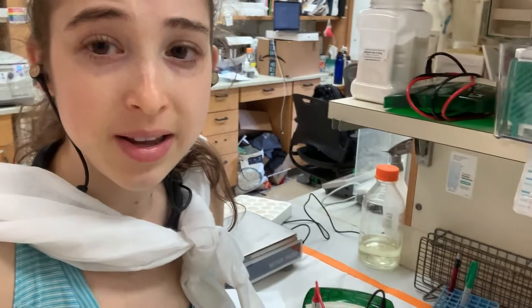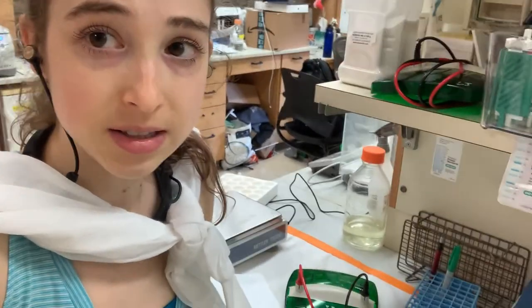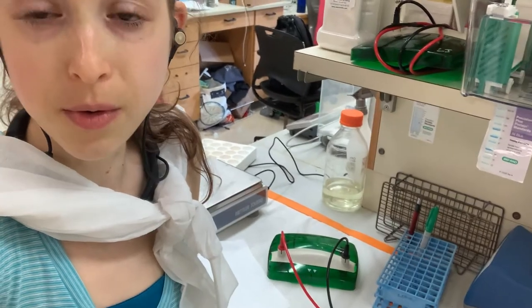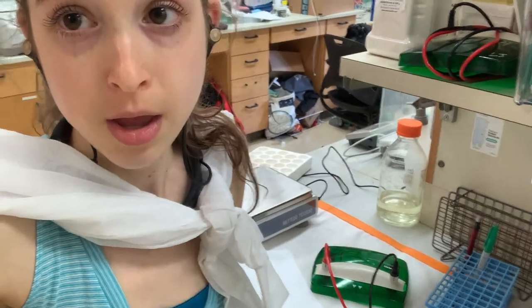Now that we've covered the theory, let's take a look at what it actually looks like, how we set it up, and some tips, tricks, things to watch out for, and how to interpret results.